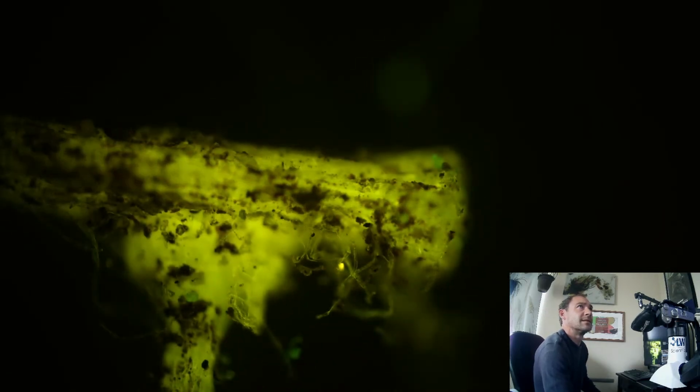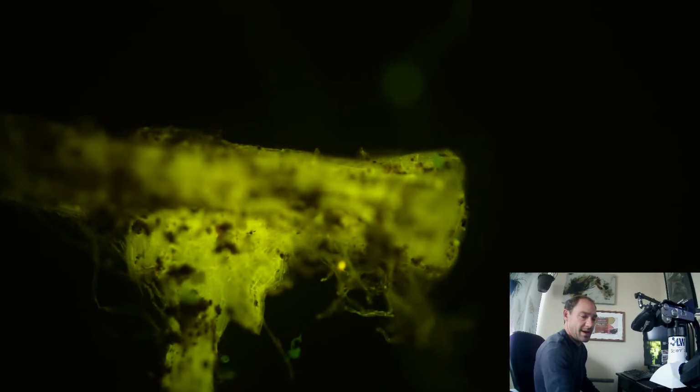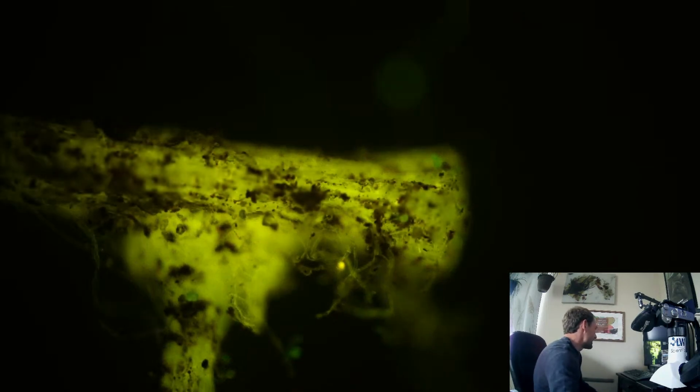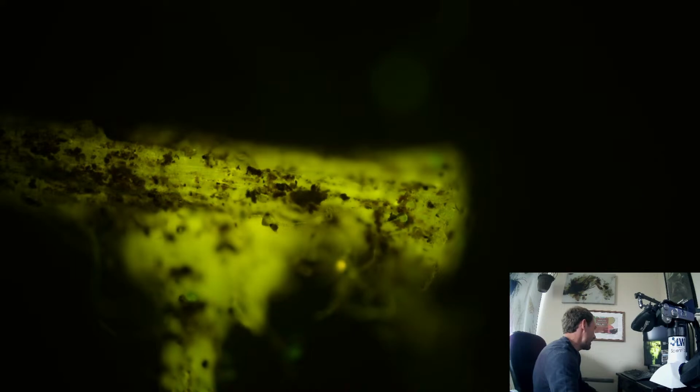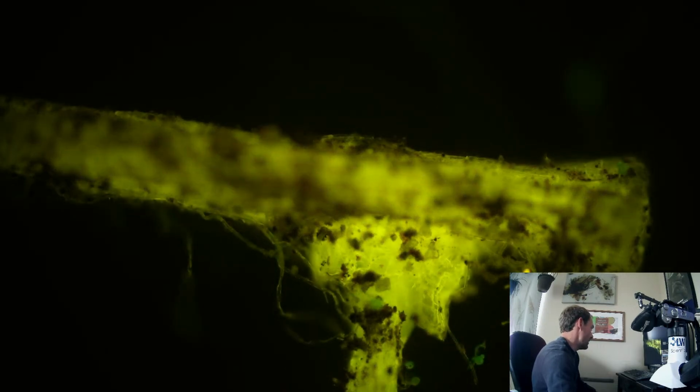Seeing all kinds of root hairs hanging off of this thing. Looking pretty neat. Very brightly glowing. Scroll on down. All the wispy things that you're seeing off the side, those are all root hairs.